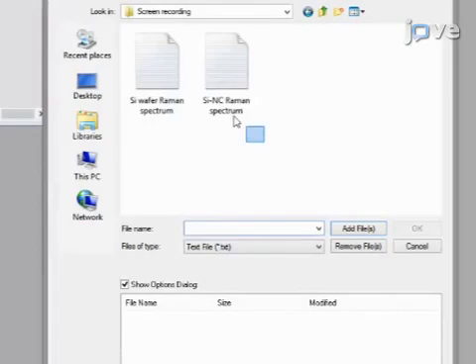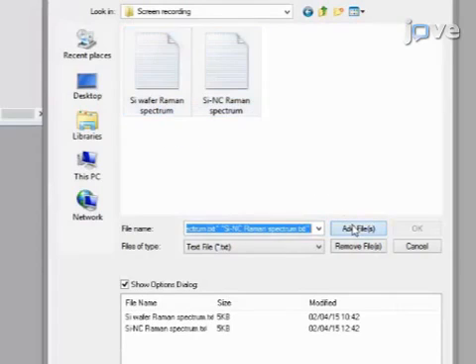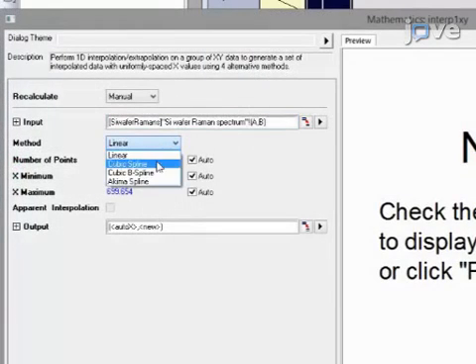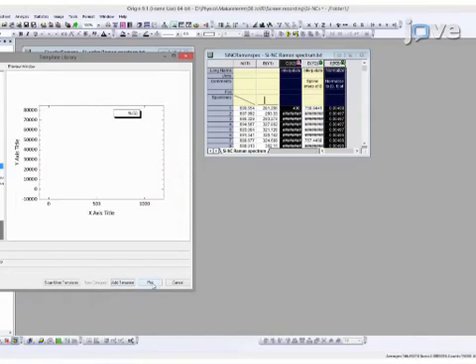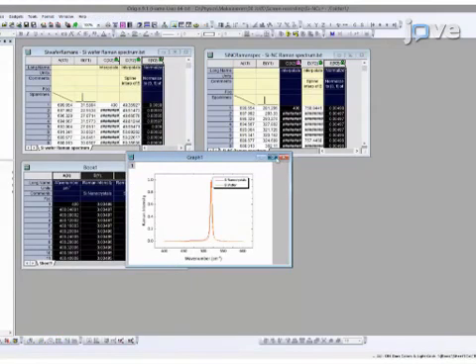First, open the text files of the measurements for the nanocrystal measurement and the bulk reference. Before plotting the data, smooth them using cubic spline and normalize the data to 1 at their highest peak positions in order to have a good comparison of the relative peak shifts. Plot the silicon nanocrystal and reference silicon data.